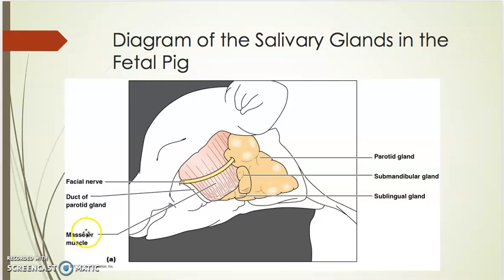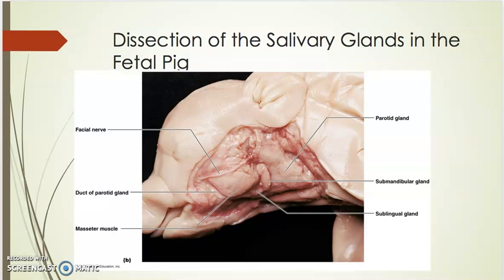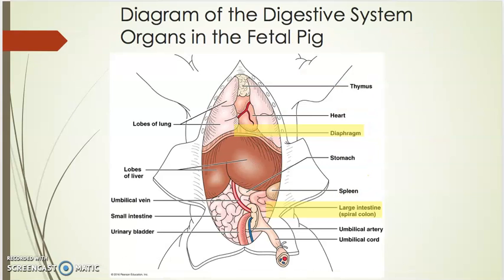You may also hear about a masseter muscle that is overlying the oropharynx. So you can know about that. You will not see that on the video, but look at that beautiful facial nerve right there that's dissected out really well. And the masseter muscle reacts to the facial nerve. The facial nerve just sits right on top of it and directs it to move. Really a beautiful system if you think about it, and your 3 glands there. I want you to know about that.